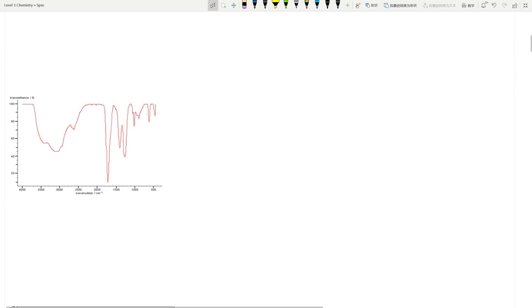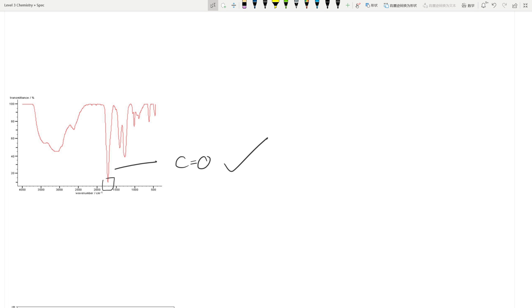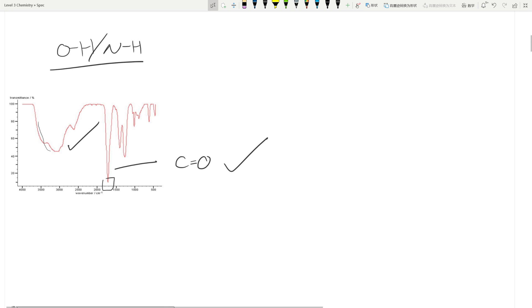So this is the first spectrum example. Anything you look for is on here. You can see this peak is between 1,600 and 1,800, so that means this is a C double bond O — I have a carbonyl group. And then this is where you have the OH/NH peak overlapping with the CH bond. So that means I have an OH or NH. How do you know if it's OH or NH? This is where you need to use the other techniques to figure out what it is. Your IR should literally take about 10 seconds — does it have a carbonyl group? Yes. Does it have OH and NH? Yes or no.